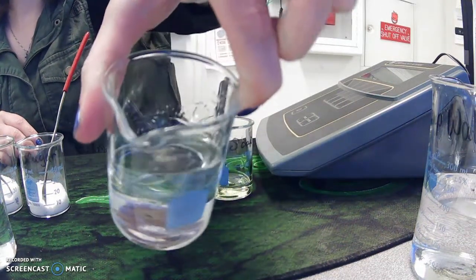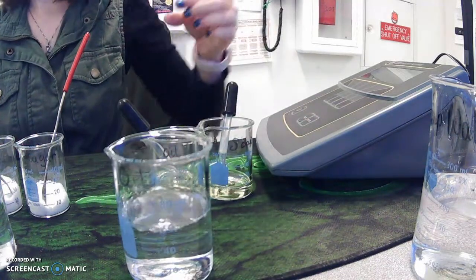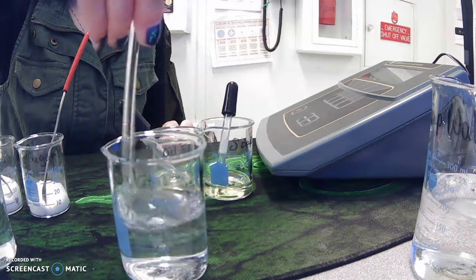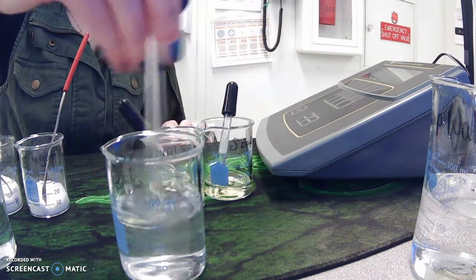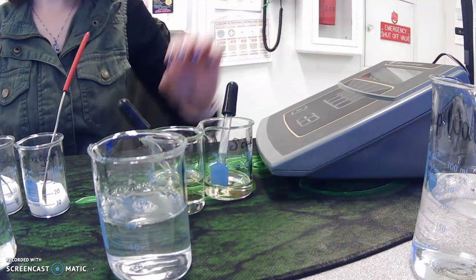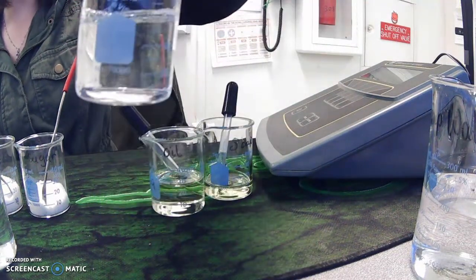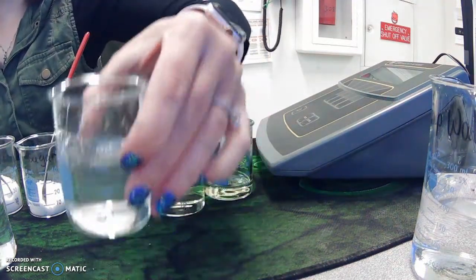Ooh. So some is on the bottom now. Some of the oil has dropped to the bottom. We stir it. Okay, a little cloudy maybe, but the oil looks to be breaking down on the top.